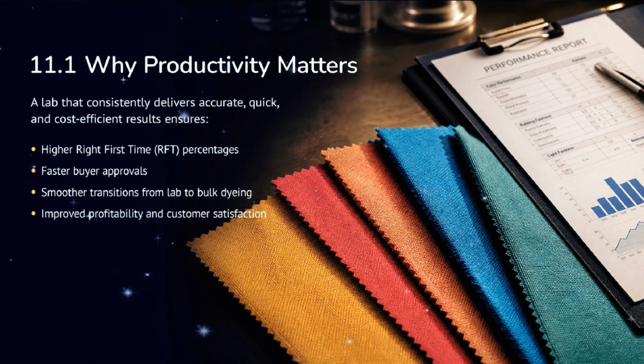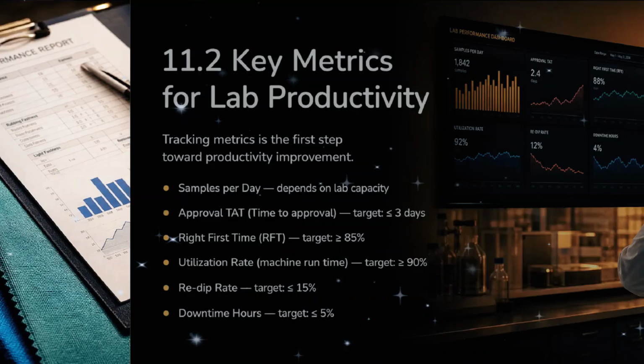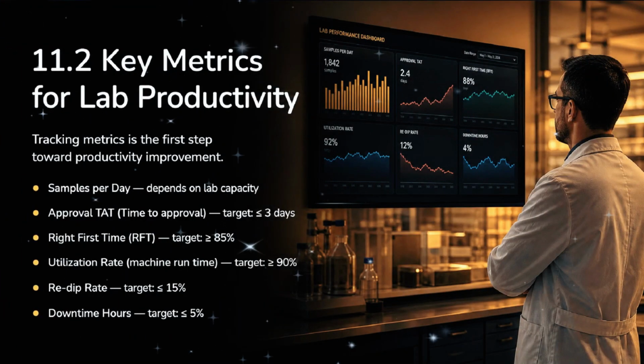A lab that consistently delivers accurate, quick, and cost-efficient results ensures higher right first-time percentages, faster buyer approvals, smoother transitions to bulk dyeing, and improved overall profitability. Tracking metrics is the first step toward improvement.